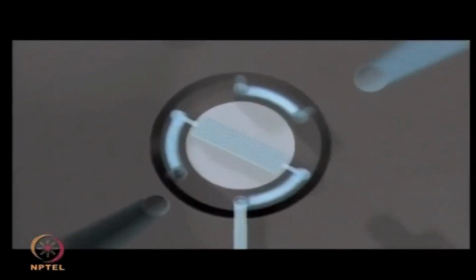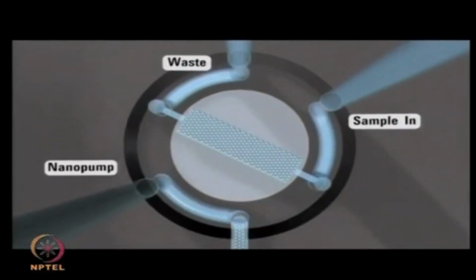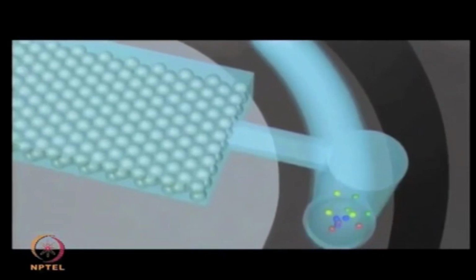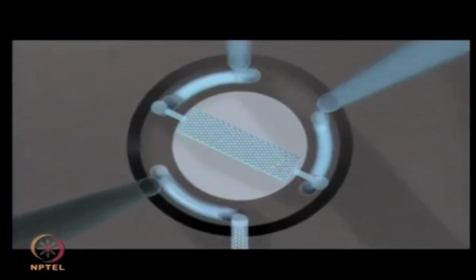Let's look at how the Agilent 1200 series HPLC chip MS system can be applied to a typical protein identification analysis. The Agilent micro-well plate autosampler loads the digested proteins. The solvent flow moves the peptides into the trapping column. The microvalve changes the flow path.